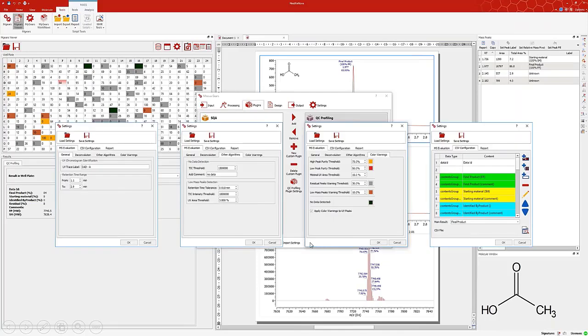You can also define things like which range of the chromatogram you want to integrate, in the first window here. Then you can also help Mgears to understand which peaks correspond to small molecular weight impurities and can therefore just be ignored, in the next window over here.